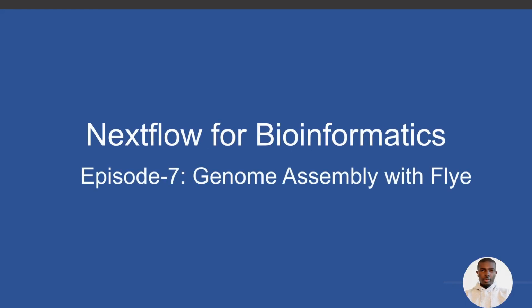Hi everyone, welcome to the 7th episode of my tutorials on Nextflow for bioinformatics. In today's video, I'm going to show you how to write a Nextflow script to perform genome assembly with Flye.